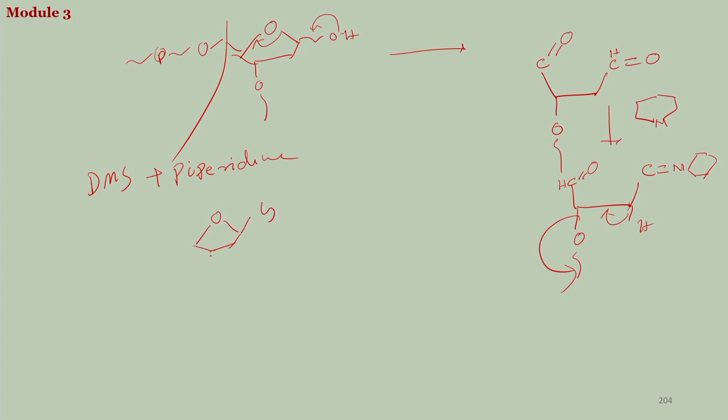If you have the G, then you get a cleavage here, that prompts you to get a cleavage here and a cleavage there. So, both the 5 prime end of the DNA as well as the 3 prime end of the DNA is cleaved off. What does that mean?